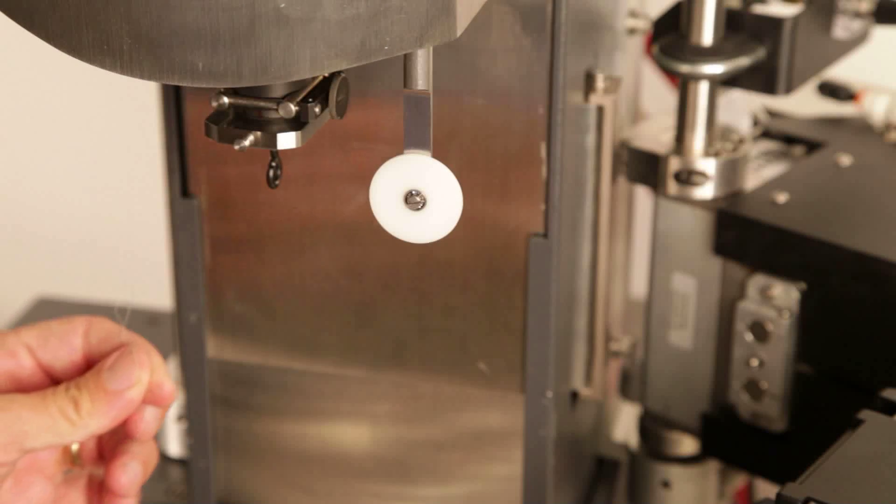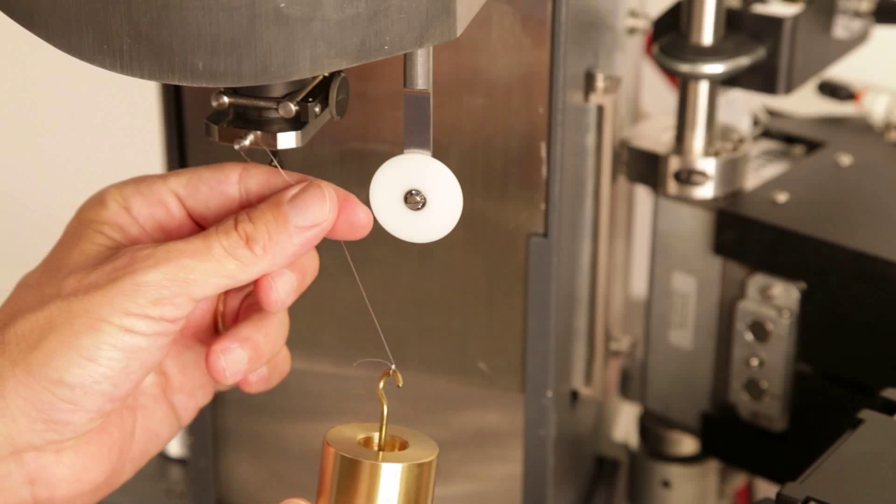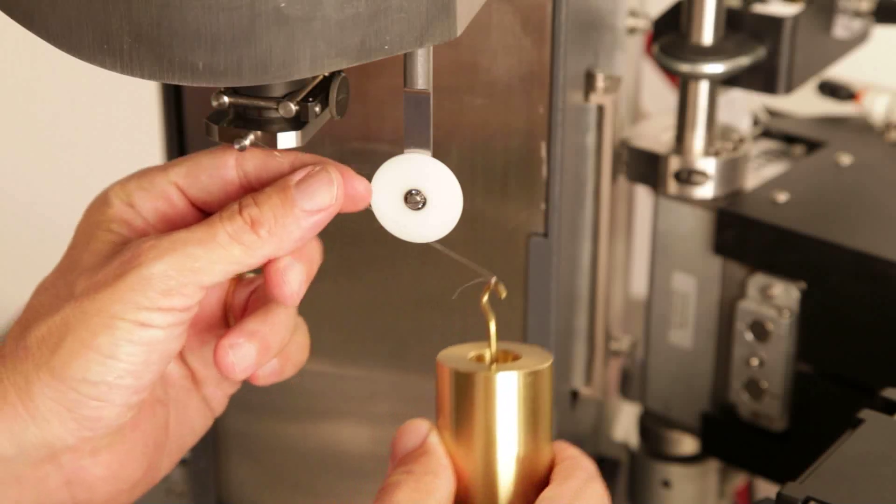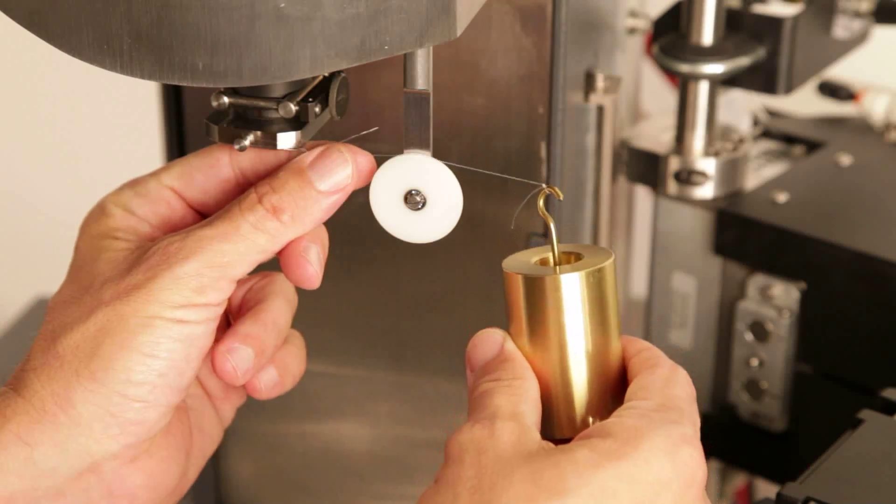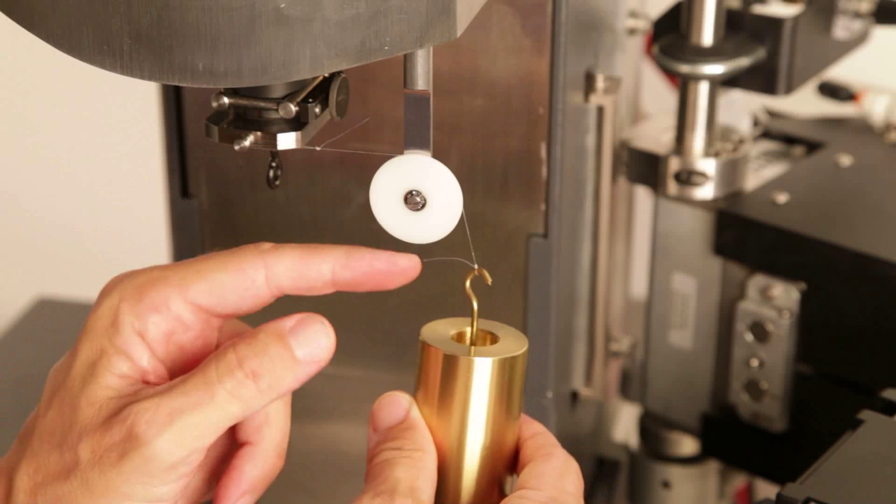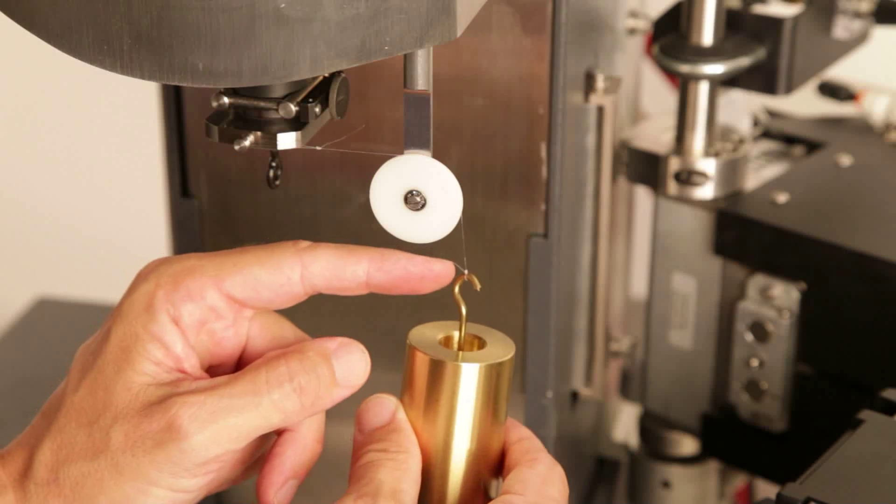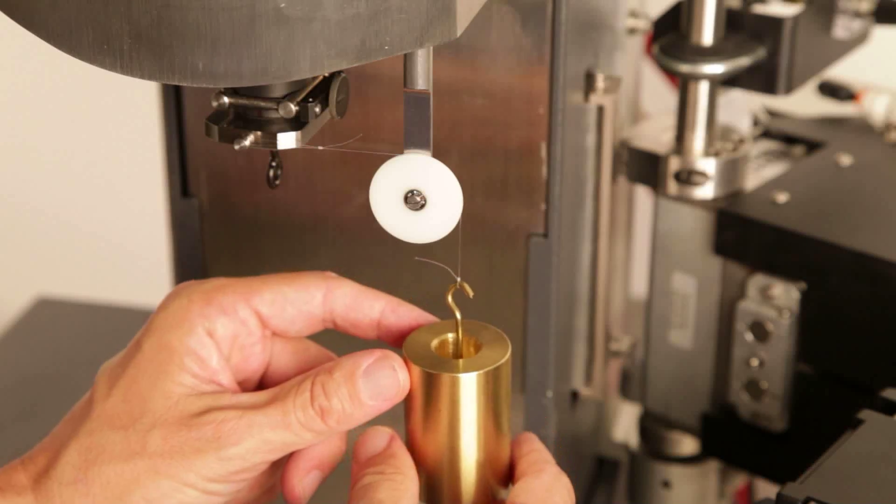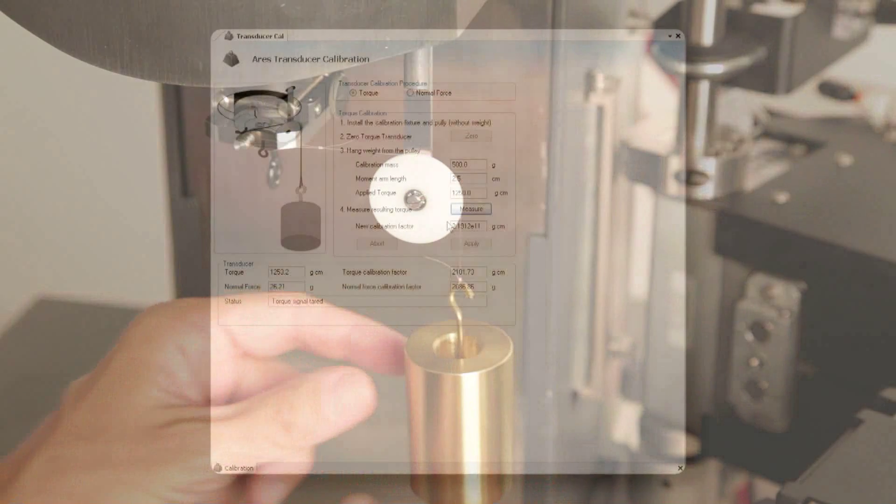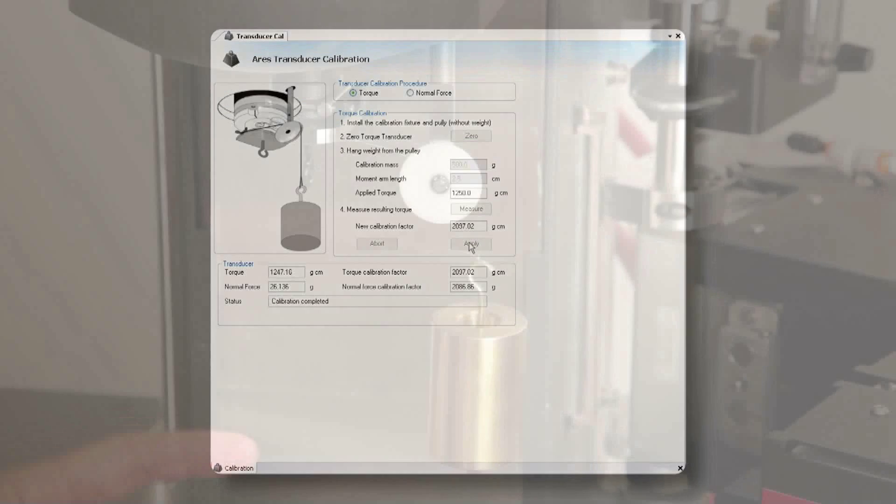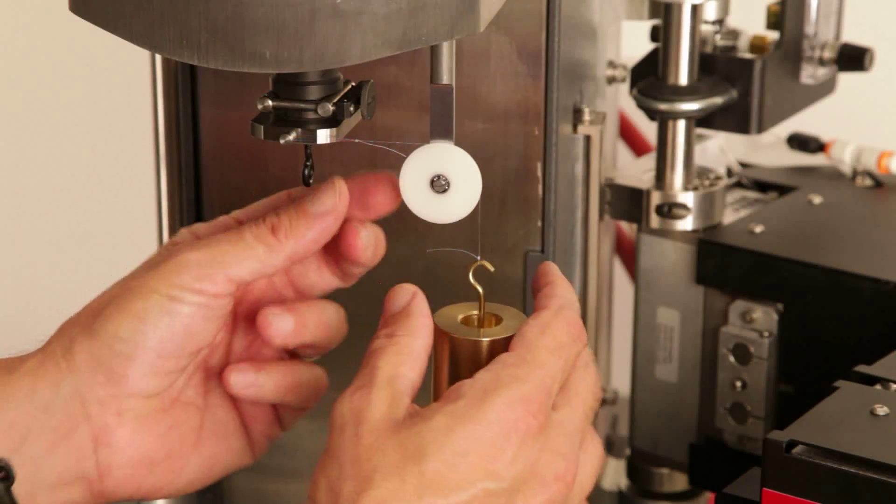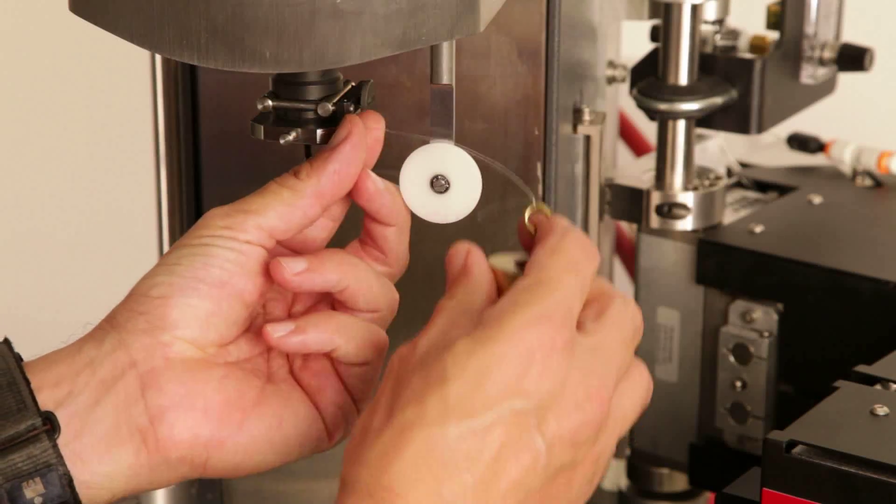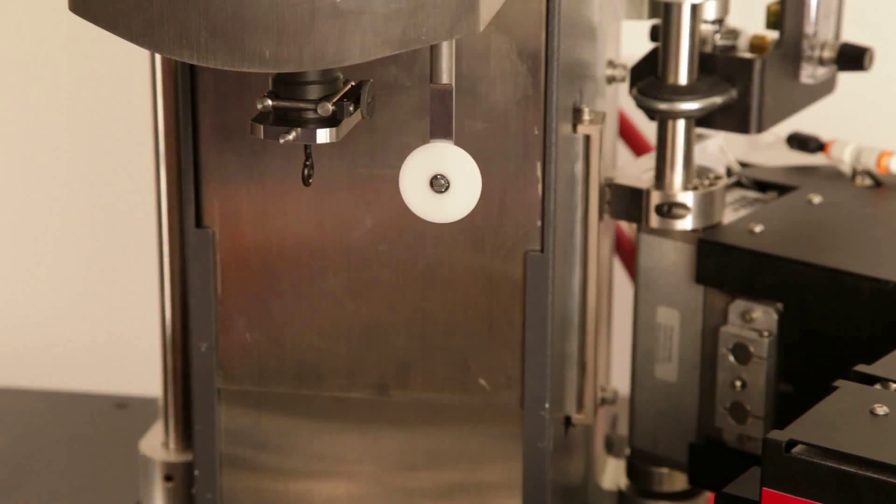Install the string with the loop at the end to the calibration fixture, then hang the string over the pulley and attach the 500 gram weight to the other end of the string with a loop as well. Choose Measure from the calibration window. After the measurement is complete, choose Apply the new calibration factors. Remove the weight and pulley system. You have completed the torque calibration.